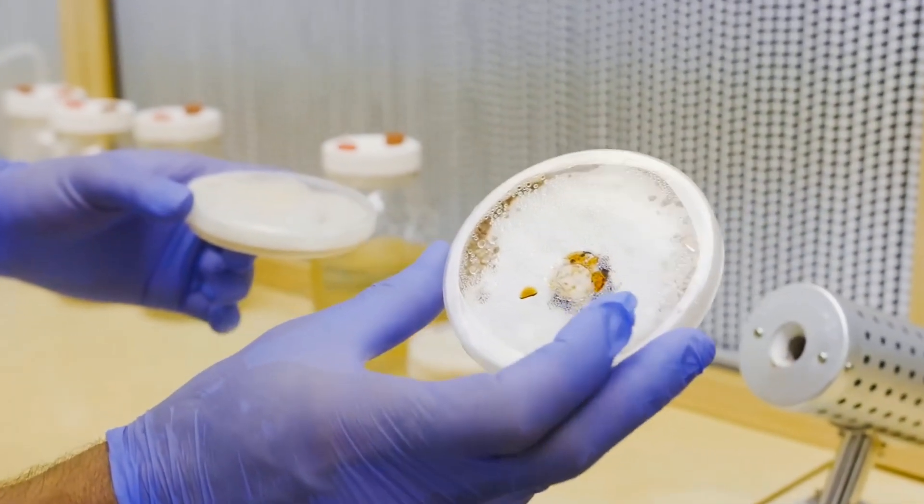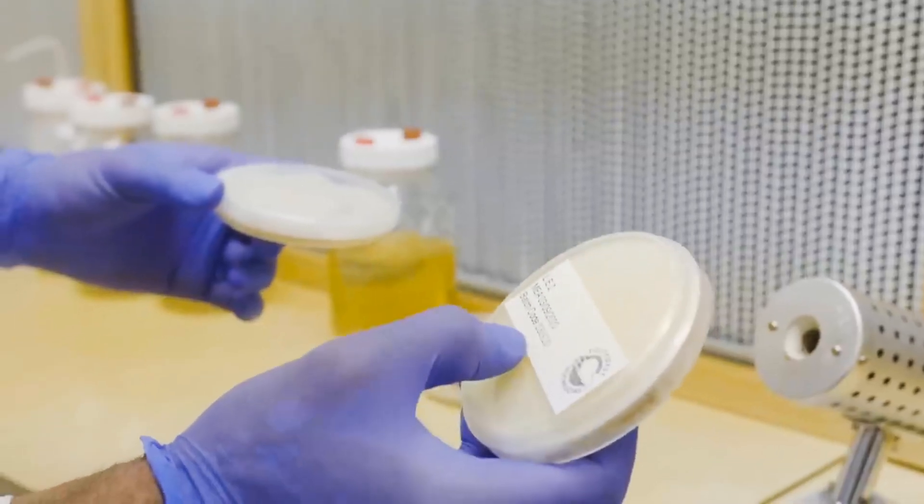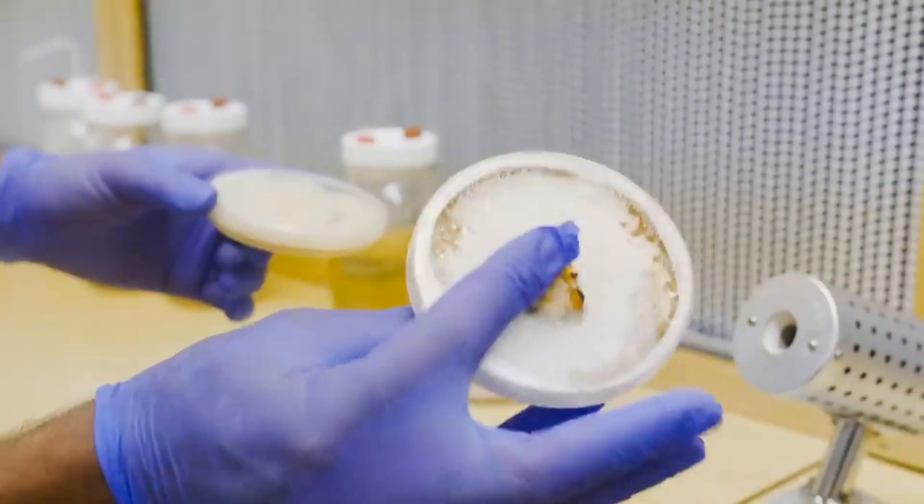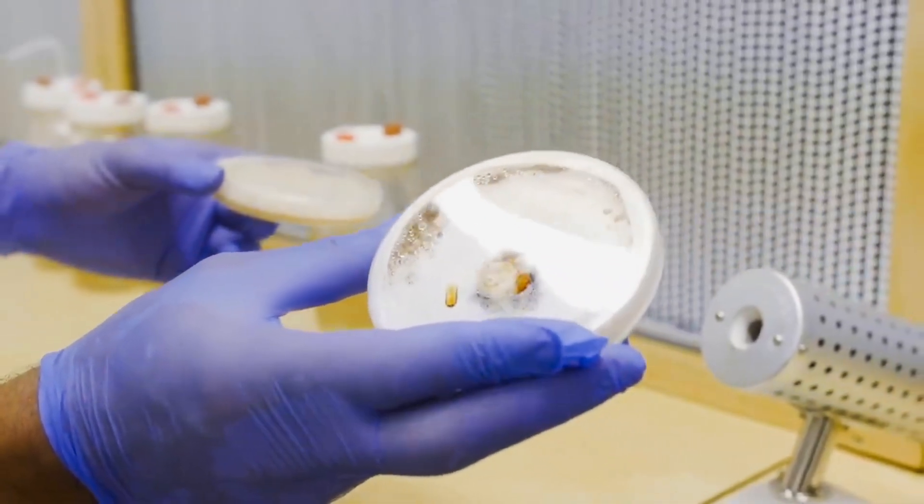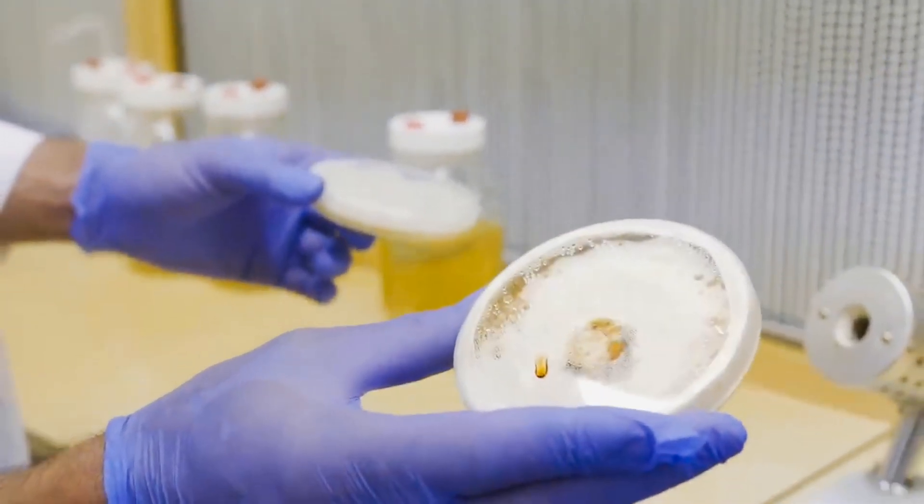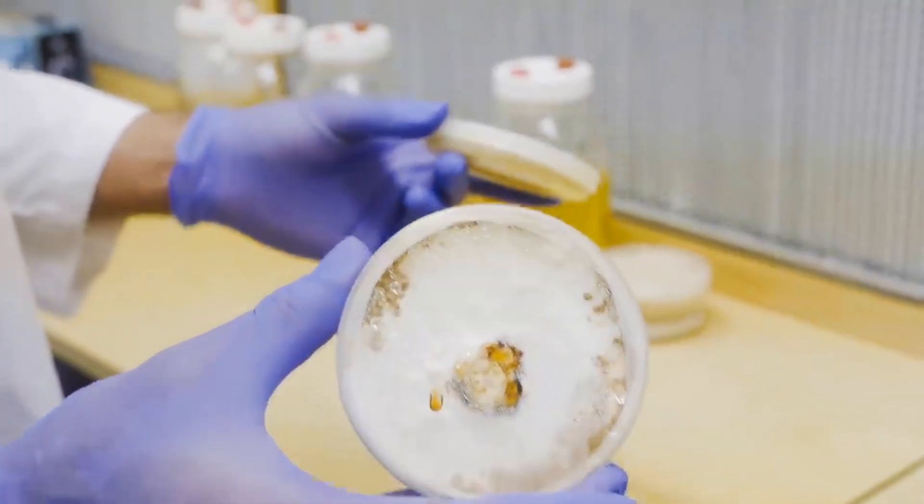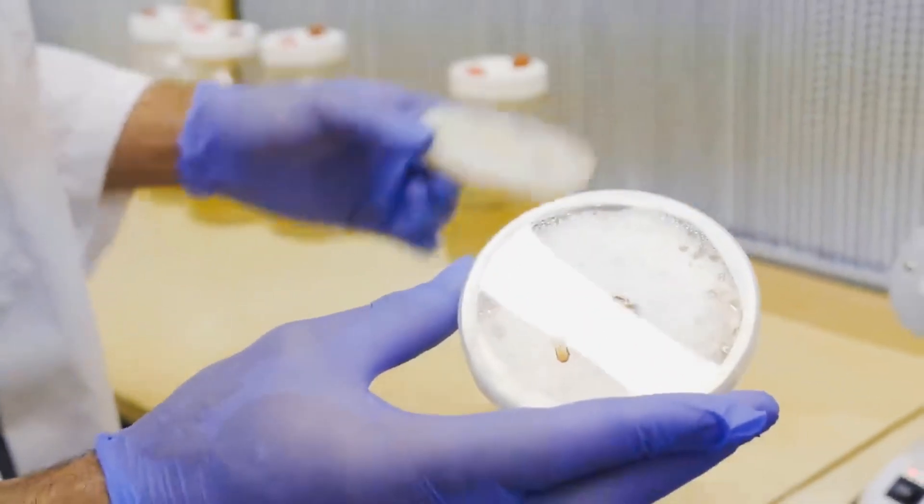This is the shiitake mushroom and you can notice this is an aged culture. This was inoculated March 9th and it starts to brown, which we'll see in our production blocks as well - as it ages the mycelium browns. A lot of new cultivators will get scared and think it might be contamination, but it's actually really healthy and totally natural.